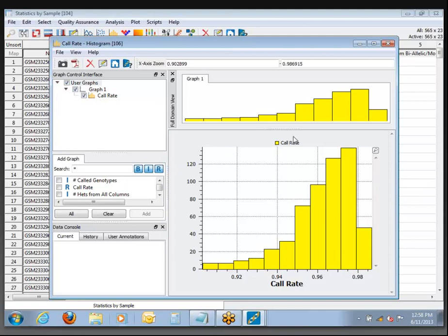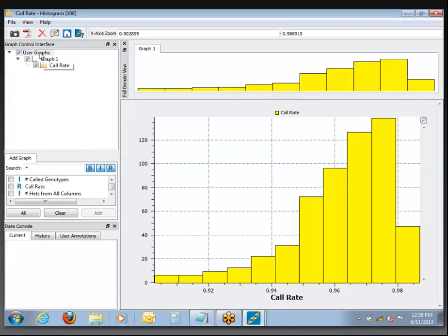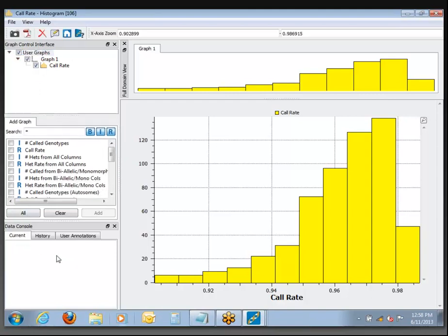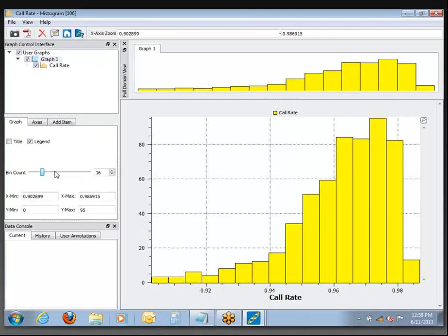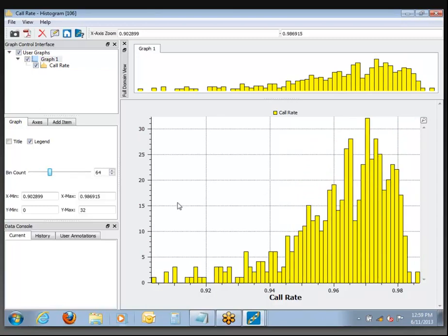The distribution grows pretty well, and then there's a drop-off up at the high end. If you want to add more granularity to your histogram, you can come over to the graph controls. When you click on User Graphs at the top level, the main option is to add notes or add another item into the plot. If you click on Graph 1, you get controls specific to how this is being drawn, including the ability to increase the bin count so you can see more of the shape of this distribution.